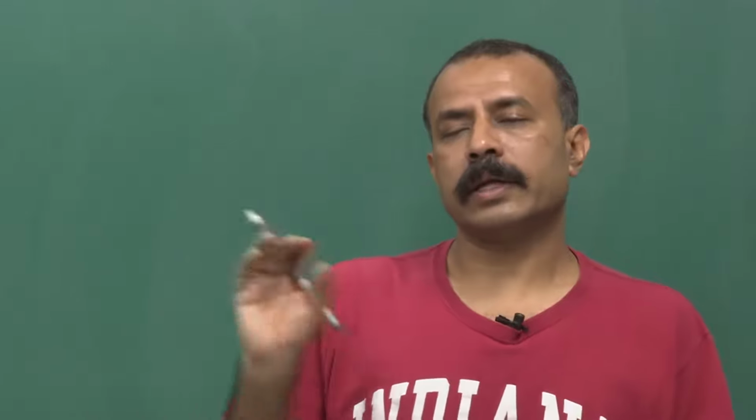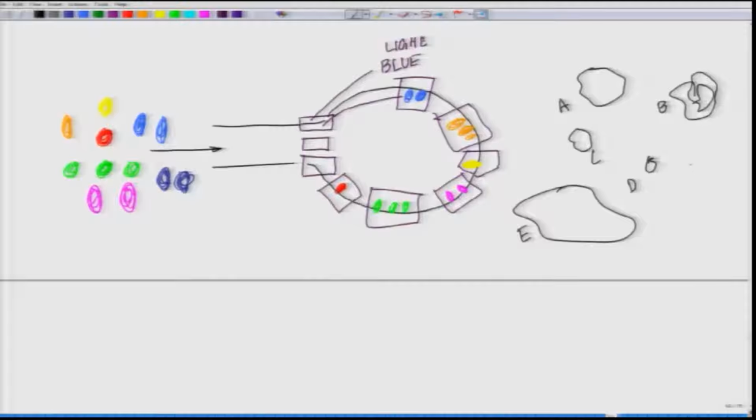Say I introduce another one, F. Between D and F you will hardly see a density difference, or similarly between A and B. You understand? So, now you have these two populations which will behave differently compared to this population.